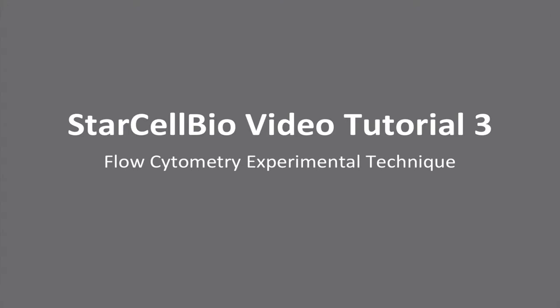In this video, we will perform an experiment in StarCellBio that uses the flow cytometry experimental technique.